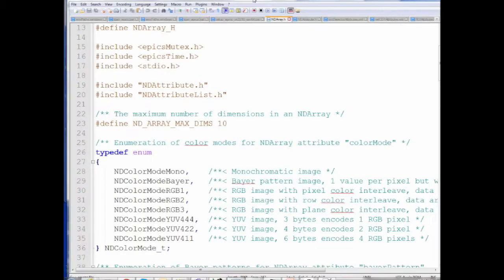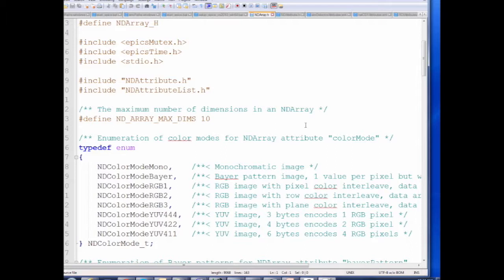This is the file ndarray.h — the header file that defines an NDArray. There's an enumeration of supported color modes: mono (one color per image, what most X-ray detectors produce), Bayer (monochromatic but each pixel has a different color filter — what real color cameras actually produce, with groups of four: two green, one red, one blue pixels).